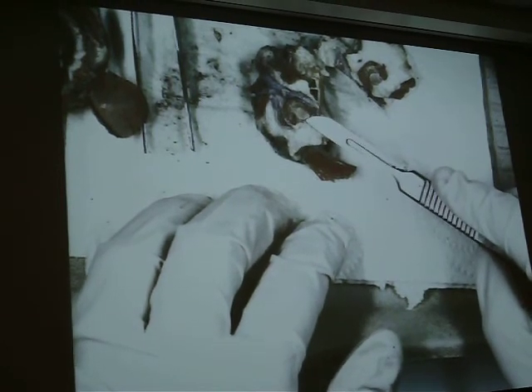That little round thing there — optic nerve. So you found the optic nerve. Is the blind spot the optic disc? Yeah, it's because there's not really photoreceptors there. That's more of a people thing — we don't worry about that in dogs and cats, but I regularly recall that from human anatomy. So we know where our optic disc is on the inside, and we know where our optic nerve is on the outside.